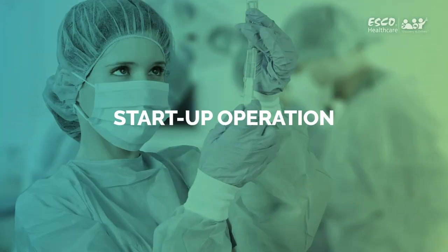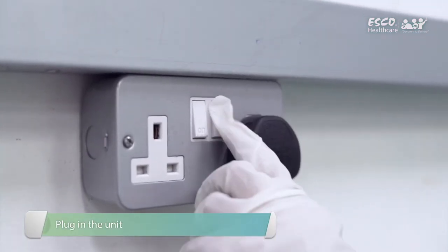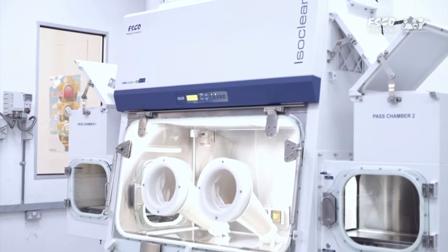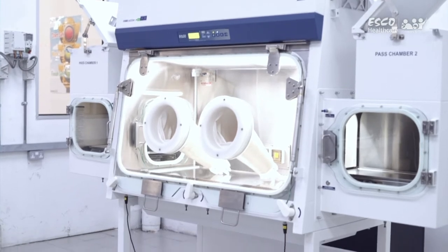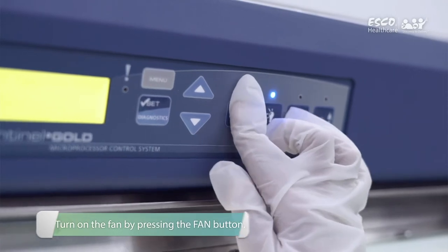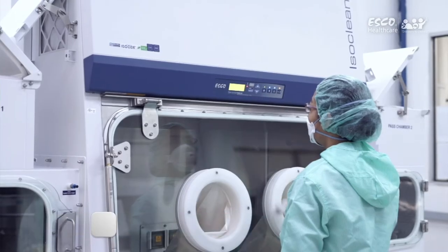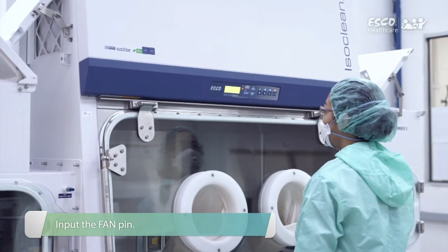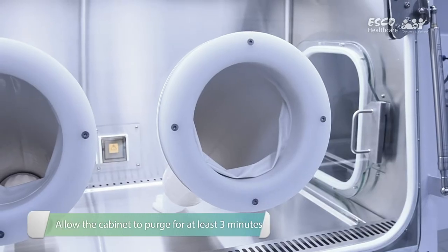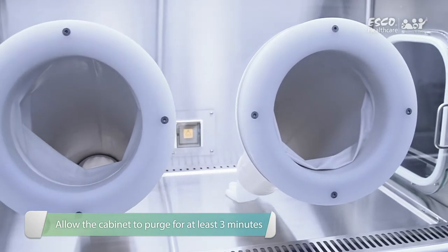Startup operation: Plug in the unit to the electrical socket. Once done, the blower will automatically turn on and start the purging process for 3 minutes. If the unit is already plugged in, turn on the fan by pressing the fan button. Input the fan pin if asked. All buttons are disabled during this period. Allow the cabinet to purge any contaminants by allowing the blower to operate at least 3 minutes before using the cabinet.